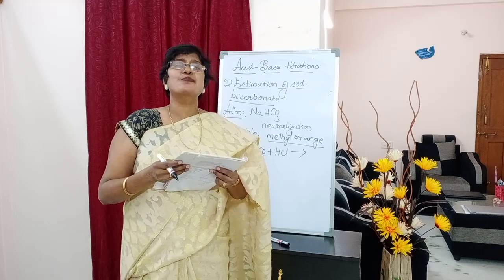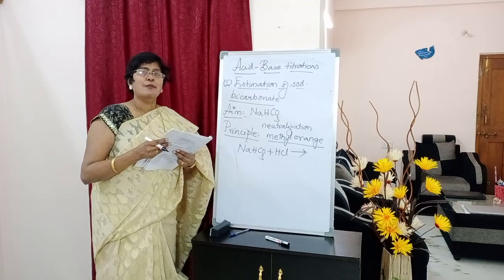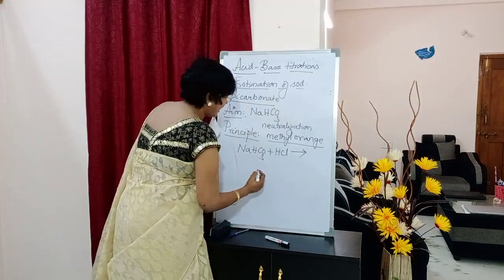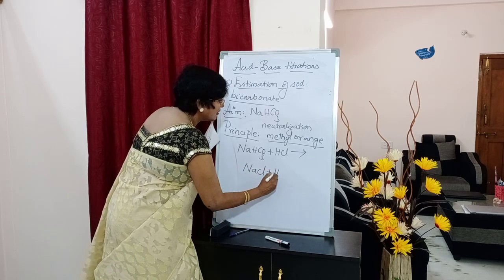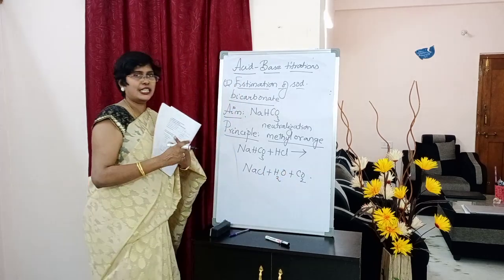Below write down the reaction. NaHCO3 plus HCl gives rise to NaCl plus H2O plus CO2.